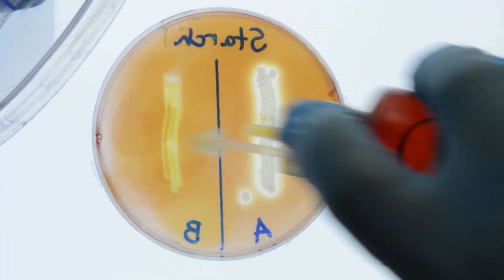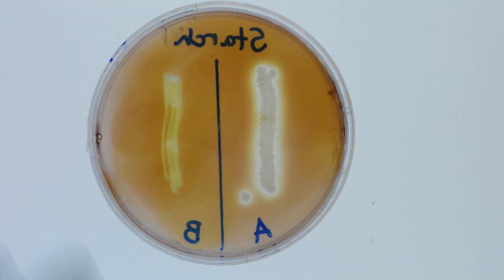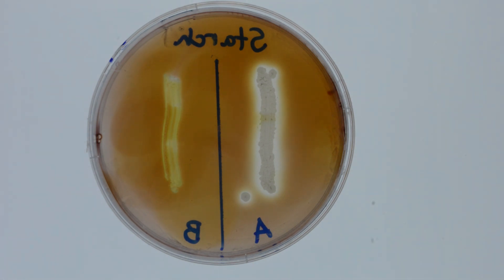If there is a change of color, the iodine is detecting the presence of starch in the agar, indicating that the bacterium did not hydrolyze the starch. This dark coloration is a negative result for starch hydrolysis.